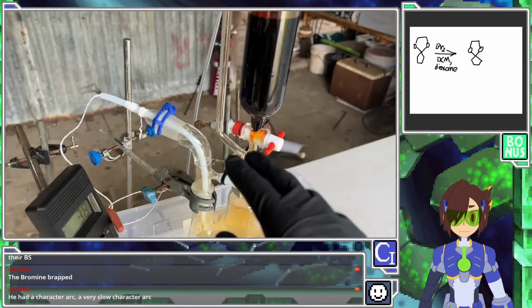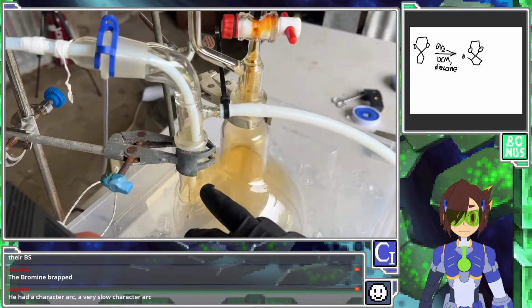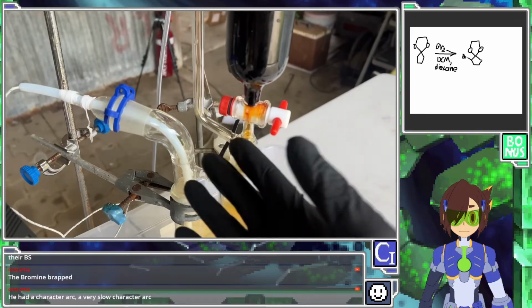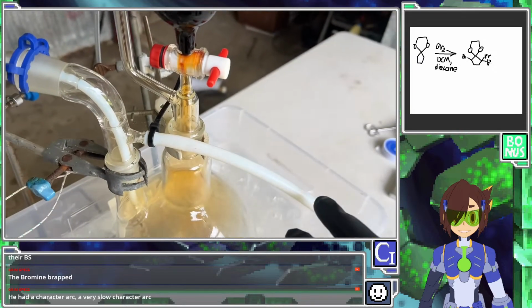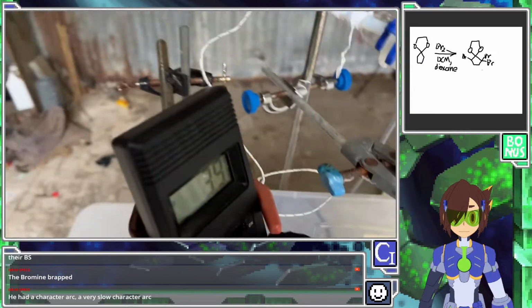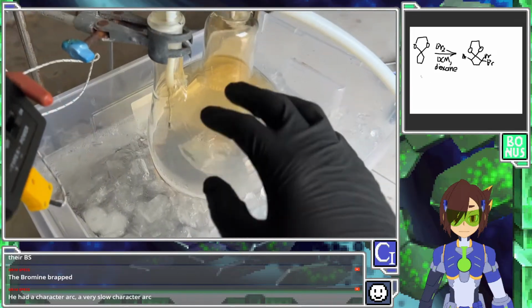It's a bit of a weird setup here. This is obviously a takeoff adapter for a distillation, very weird for it to be used in this circumstance. I'm just using it because I can't find my Claisen adapter, so there are better adapters for this, but that's fine. Any glassware will do. This is Teflon tubing coming in here, and this is fitting a temperature probe in there. It's currently reading 3.9 degrees Celsius, which is great. This is on the cooling bath.